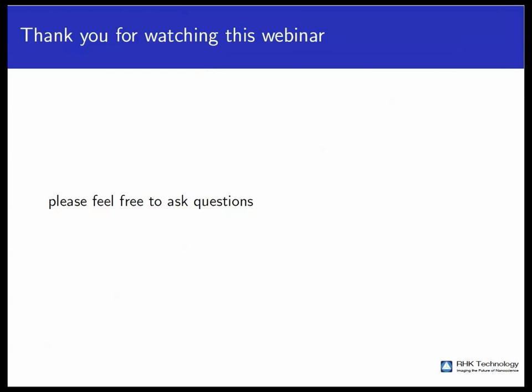Those parameters are pretty much the same. It doesn't really matter that much what cantilever you use. There is a phase and there is a phase margin that needs to be watched. I don't think it requires much settings. If it unlocks too frequently, then you can set the phase margin up a little bit. If you have rough samples and the PI controller has a tough time, you can increase that limit a little bit and thereby make it still keep lock. But that's all. It depends more on your sample than on the cantilever.